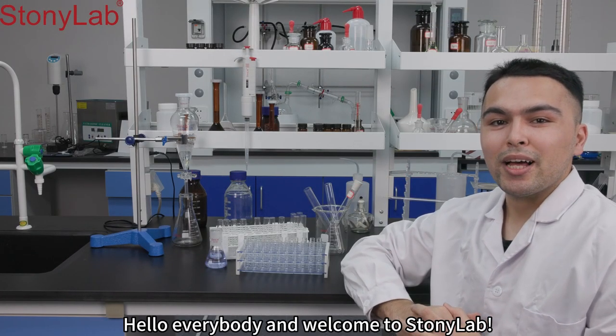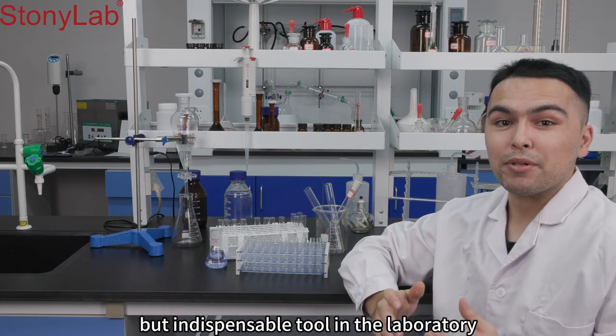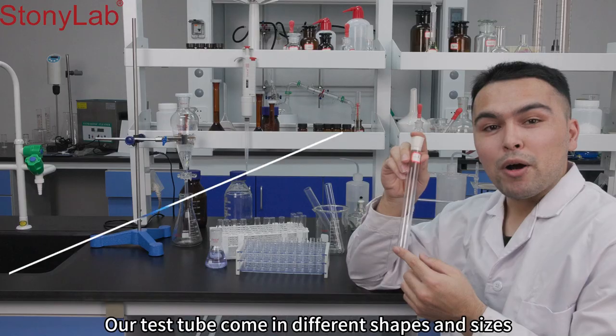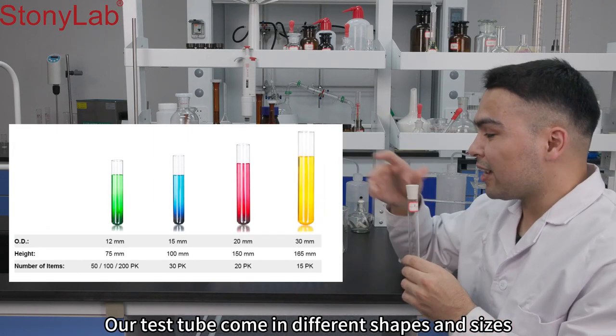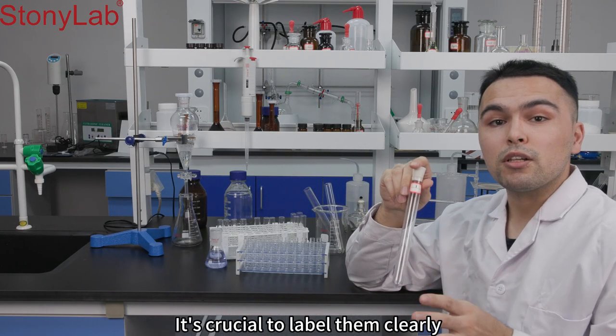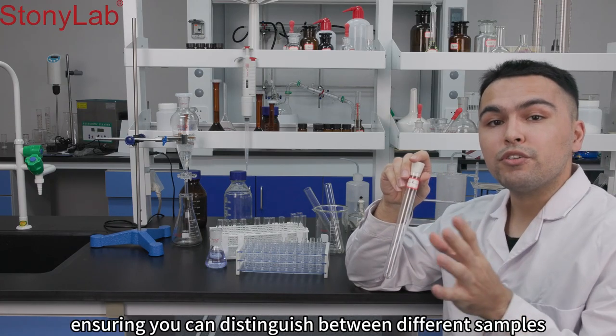Hello everybody and welcome to StonyLab. Today we'll explore a common but indispensable tool in the laboratory, the test tubes. Our test tubes come in different shapes and sizes to suit a variety of experimental needs. It's crucial to label them clearly, ensuring you can distinguish between different samples.